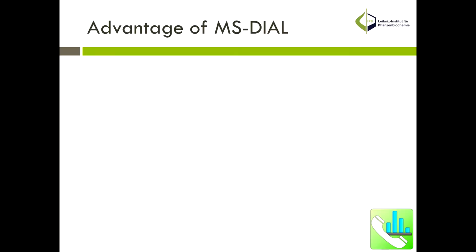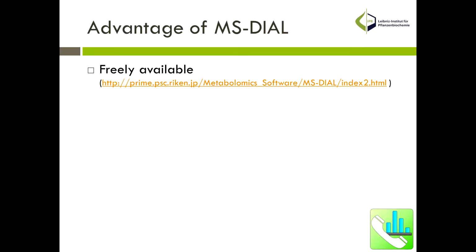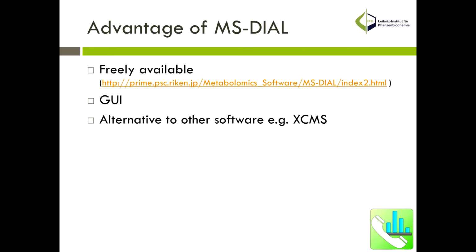Now on to the data pre-processing phase. Before I demonstrate how to use MS-DIAL, I will mention a number of advantages of this program. First of all, MS-DIAL is freely available. Users can download this program from this website. Secondly, it has an easy-to-use graphical user interface.